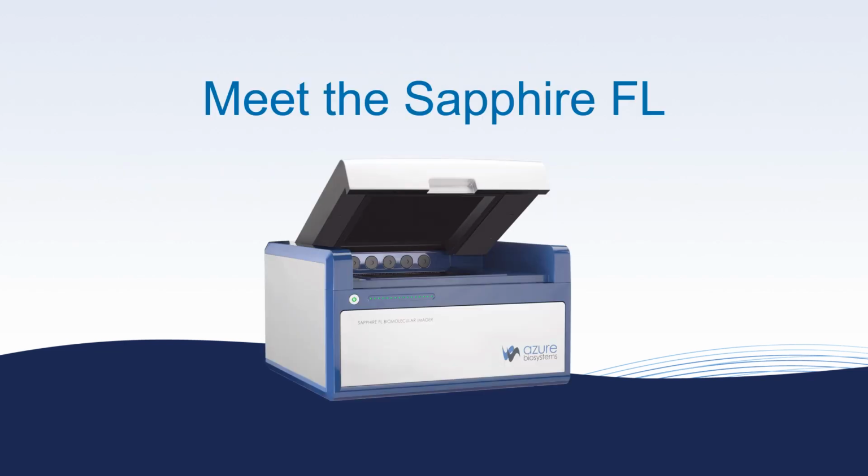I would like to begin by introducing you to the instrument, the Sapphire FL Biomolecular Imager. This is a tabletop, high-resolution scanning instrument with a variety of features we'll discuss throughout this presentation.